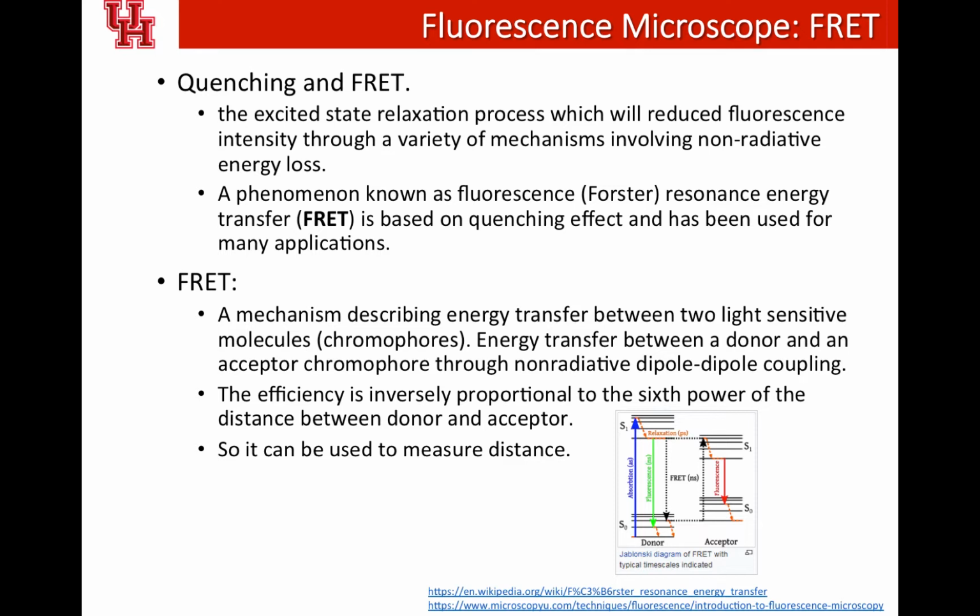Supposedly it should re-emit light, right? Supposedly, going back to the ground state, it should re-emit light. However, there are all kinds of mechanisms that will trigger non-radiative energy loss. For example, FRET is just one example. Supposedly the blue light excites the molecule to the excited state, and then after some relaxation, it goes back with green color emission.